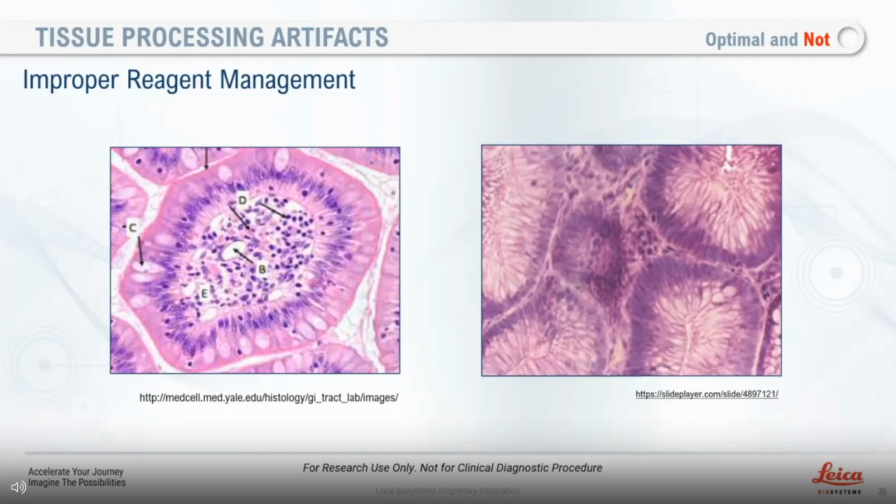Next question. How long can tissue be kept in neutral buffered formalin before tissue processing for histopathology? I think that's a repeat of the last question. It depends if you're in the clinical or life science arena. There are restrictions here in the United States in regards to certain specimens about formalin fixation, but as long as you're keeping that 24 to 48-hour window, you're good. All right. Thank you.